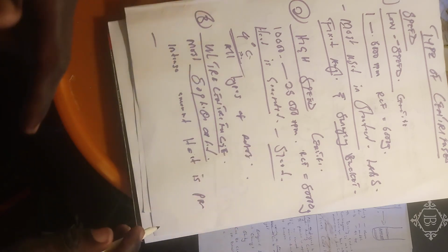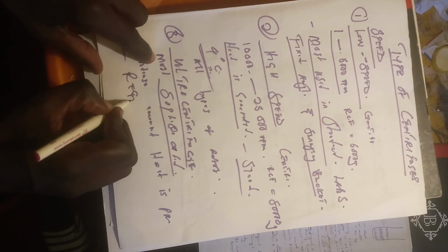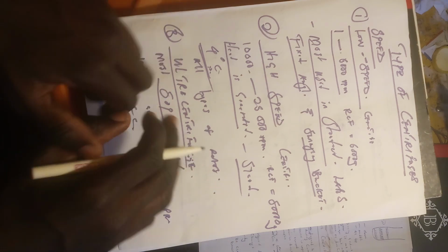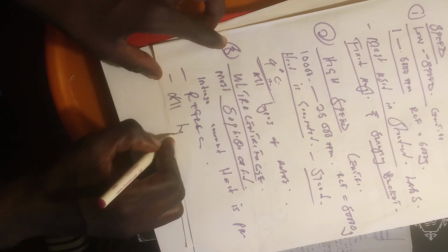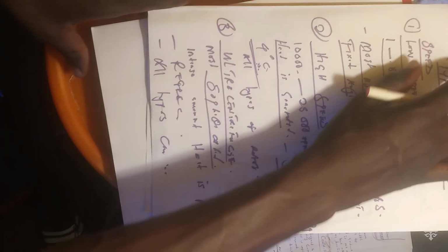Why? To maintain low temperature. So there is refrigeration in the rotor chambers to maintain low temperature. But the goodness is that all types of rotors can be used. The swinging bucket, the fixed angle, and the vertical tube can be used.